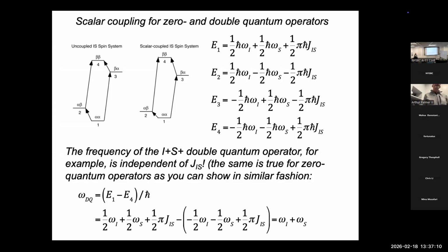In the C alpha, they're more like 140 hertz, and the aromatics are even larger. So then it's hard to pick one. They're not so different that you can manipulate them easily independently, but it's hard to find a delay that's good for all of them. There's compromise. You have to make a compromise.